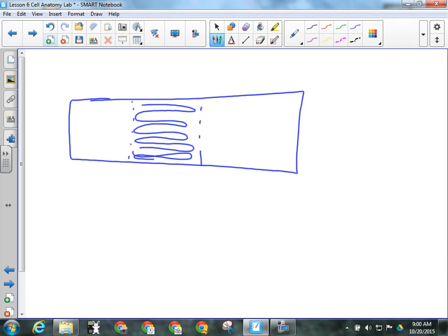That small adjustment is underneath the stage. Underneath the stage, you see this. There's what's called a condenser. It looks like kind of a tube that's underneath the stage, and there's a little tab on it. That opens and closes the iris. You might have used that inadvertently in the microscopy lab.